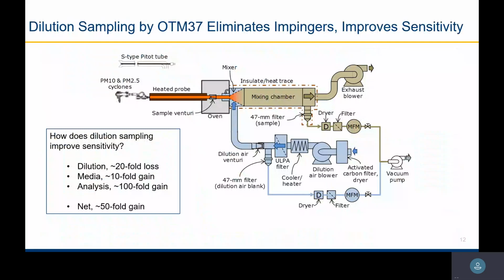We've been doing about, probably since 2018, about 3 or 4 a year for different clients. So we've got 3 sets of the equipment, enough to do 3 sources at once. And I think we did it 5 times in 2021. We've got, I think, 2 scheduled for 2022. So it's not being used nearly as much as Method 202 because we haven't had the need on the sources. The ones that we've used it on most are ones where they don't know if they're going to pass their current particulate matter limit. So every time they go and test for particulate matter, it's a cross your fingers and pray we pass.